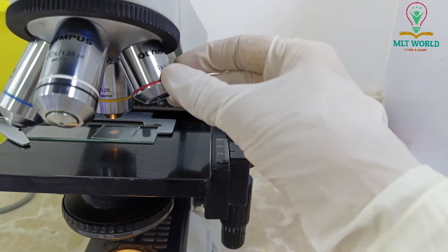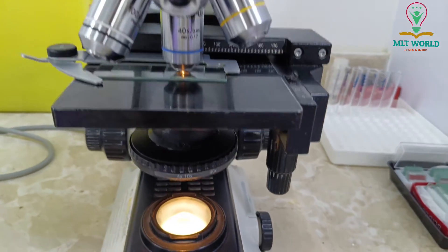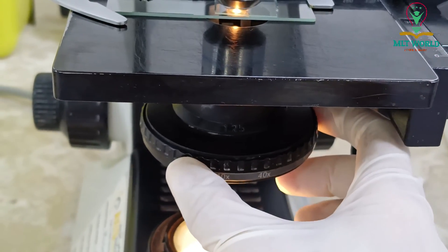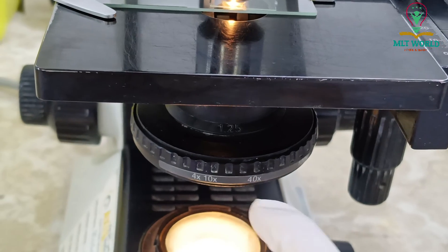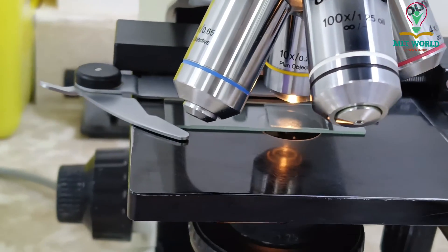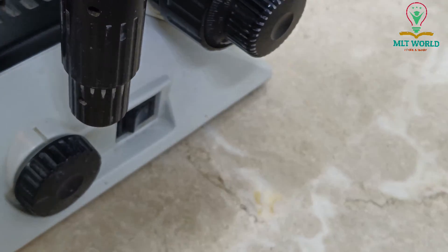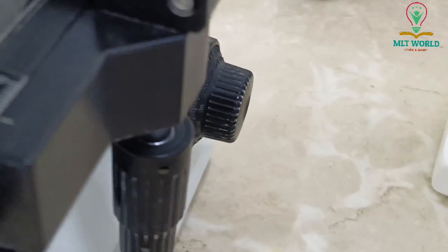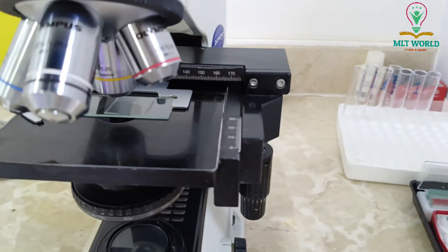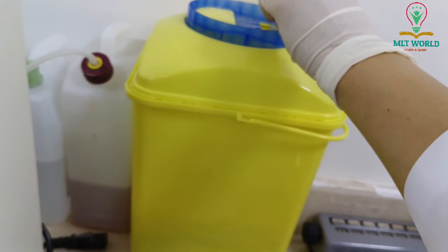First was 10x, and once the field is clear I change to 40x. Once I change the lens, I also move the condenser slightly to match — to 40x. And when we use the 100x oil immersion objective lens, I will also set the condenser to 100x to support a clear image and make microscopy more clear.